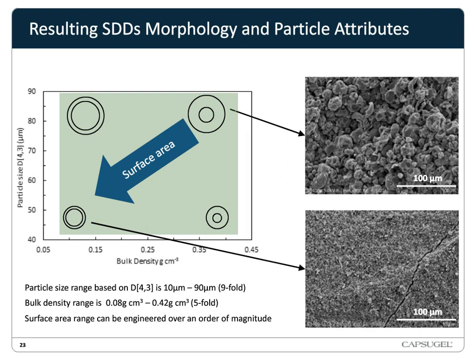And looking at the surface area, this is a difference of about an order of magnitude. The SEM micrographs on the right represent the native particles at the same magnification. There's a pretty stark difference, we can just see the difference in surface area between these two particles is pretty big. And so we would expect that results in some pretty big differences during tableting and in its mechanical properties.